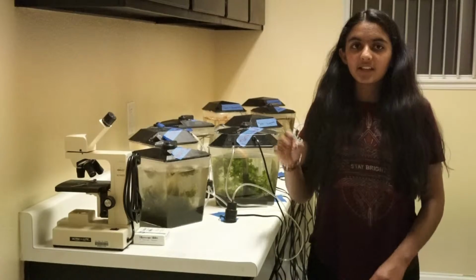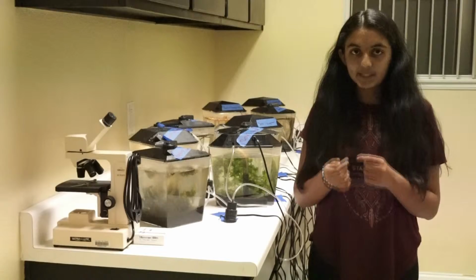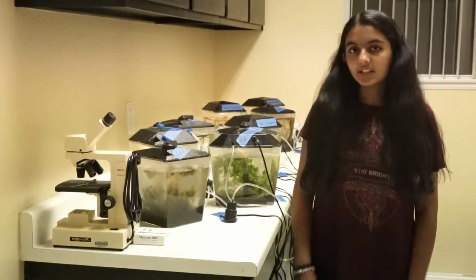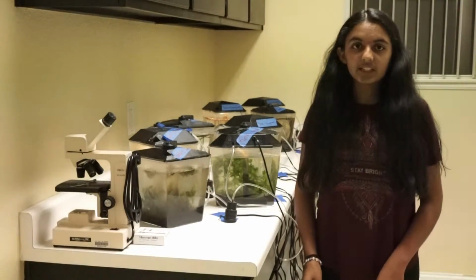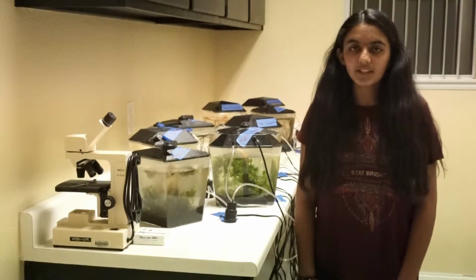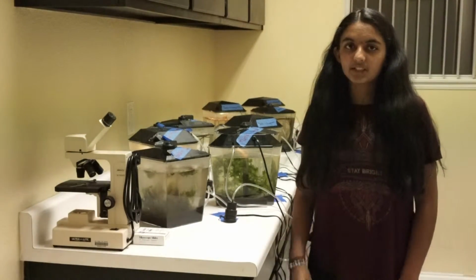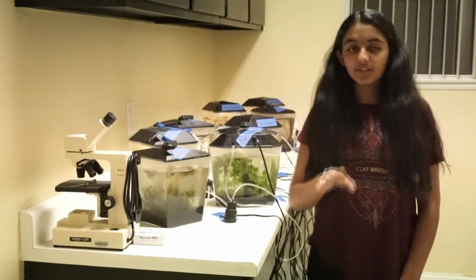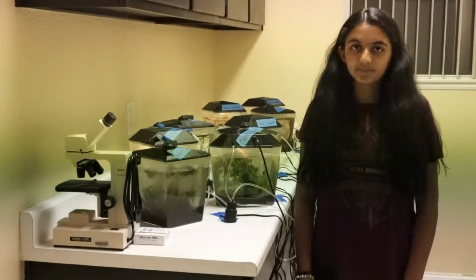To examine the sea lettuce and seagrass under the microscope, I took off a little piece of either the blade or the thallus and placed it on a glass slide. Then I placed the glass slide under the microscope lens and counted the amount of dead plant cells that were visible. I used that number and subtracted it by 50, which was the amount of plant cells that could be seen under the microscope. That gave me the amount of living plant cells, and I recorded that for the results.